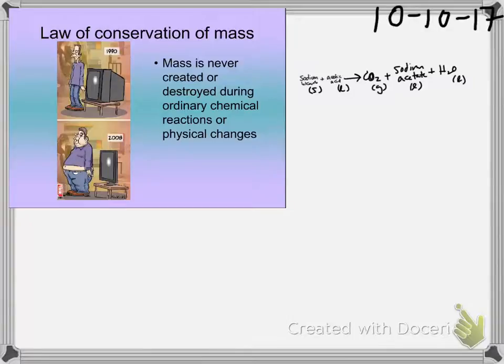So you've added mass because you've chemically bound oxygen to the magnesium. That's pretty cool. But how confusing is that for people prior to the chemical revolution to see that with some things, something happens and they lose weight. With other things, something happens and they gain weight. So it really was pretty revolutionary, the kind of observations that were made about quantitative chemistry.